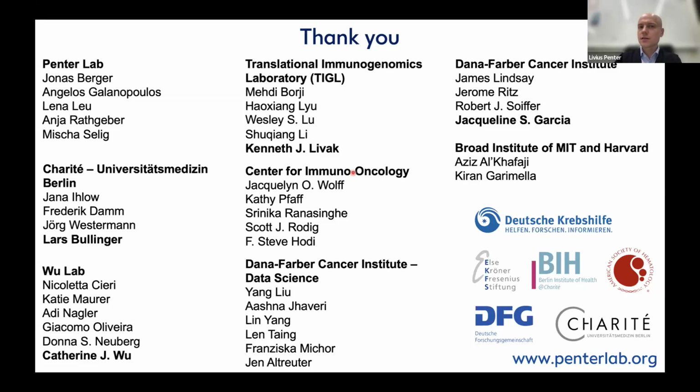Yeah, that's a very good question. Cell type annotation is something that you can really spend a lot of time on. One of the really efficient approaches nowadays is to use reference data sets where you perform a label transfer. So this is what I've done. I've taken an annotated normal bone marrow and performed label transfer, and this basically automatically defines your cell types.